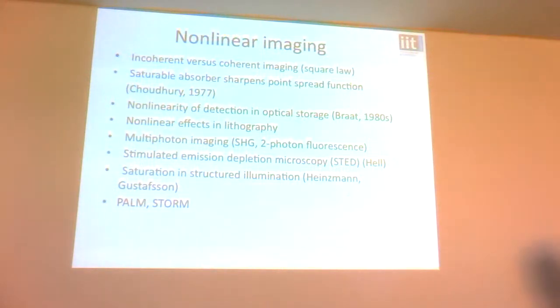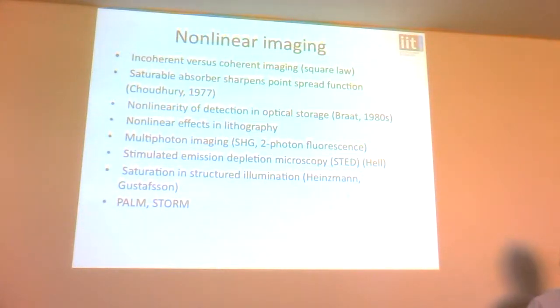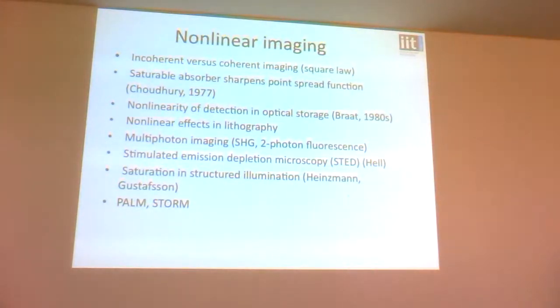Then there's STED. I'll say a bit more about that in a minute. It's been interesting to follow what people say about STED. There is a view that this is certainly a very non-linear sort of process. Stefan Hell refuses to accept that it's anything to do with non-linearity. I'm not really sure why he doesn't want it to be thought of as non-linearity. But anyway, he's always talking about switching or states or various other things, but he's very firm on the view that it's not really non-linearity.